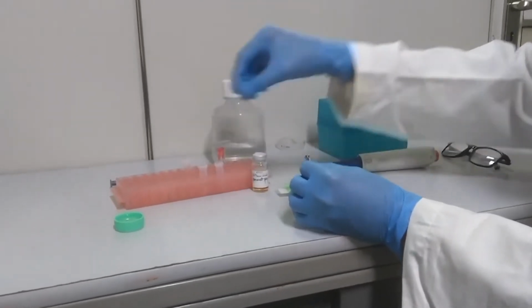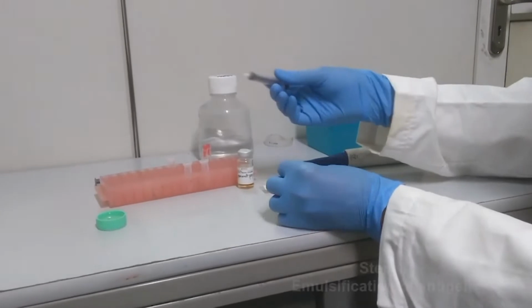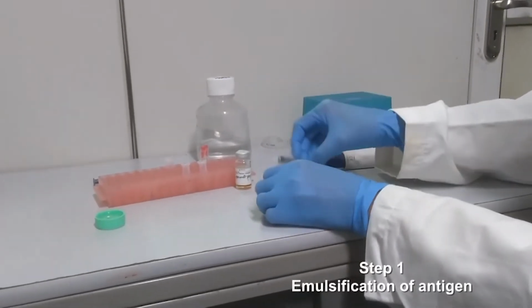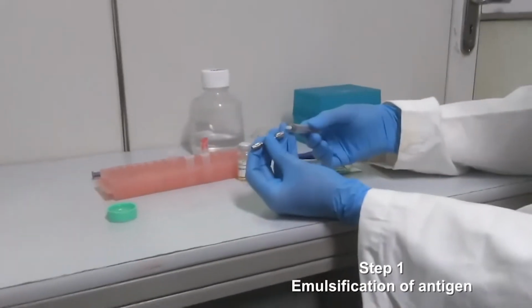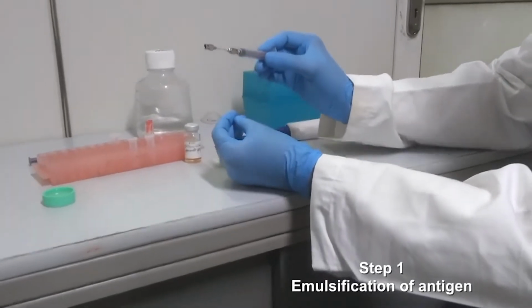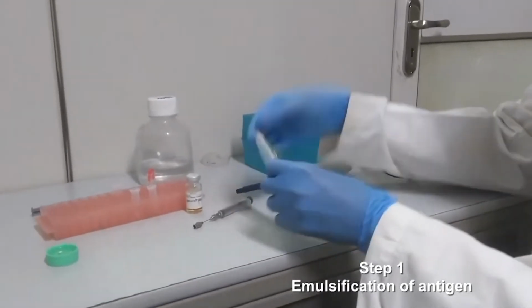After mixing them, we take it out in a needle. Using a needle, we take it out in a syringe like this, and then we fix the microemulsifying needle onto it. Attach another syringe to it.